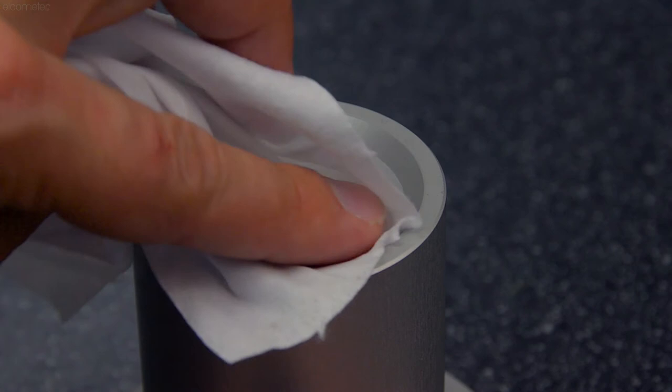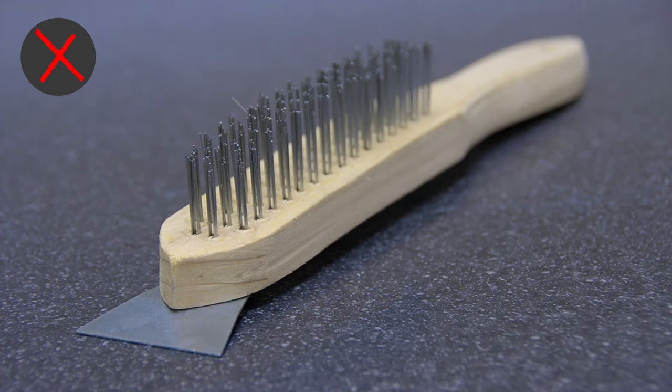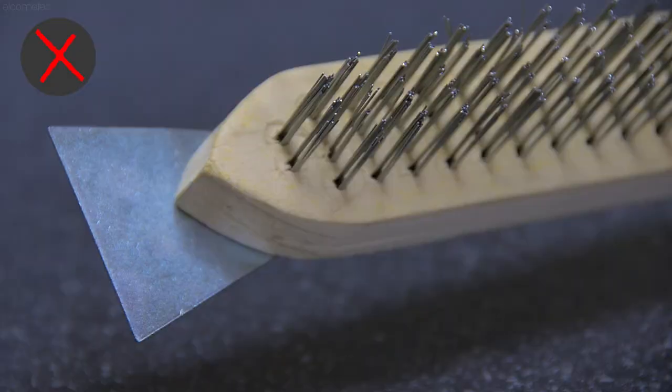Using a suitable solvent, ensure the cup and orifice are clean, as dirty equipment will affect the accuracy of the test. Do not use any abrasive cleaning tools, such as wire brushes or metal scrapers, as this will damage the cup, again resulting in inaccurate results.